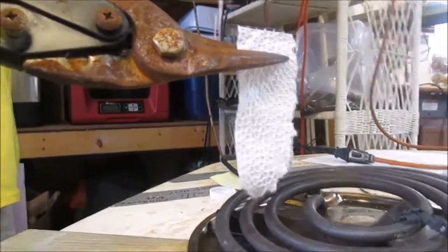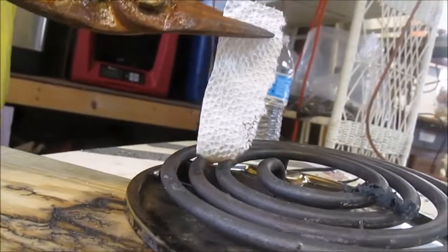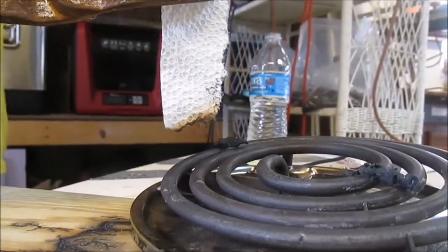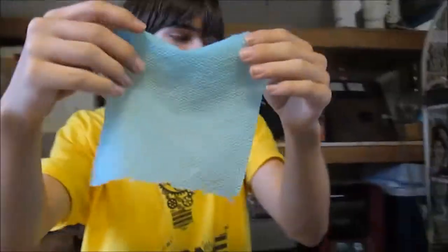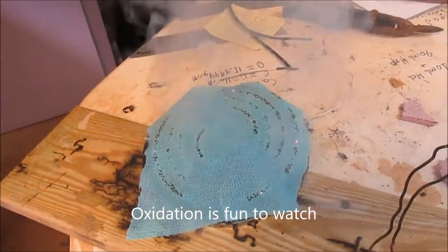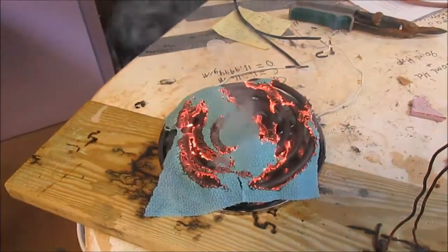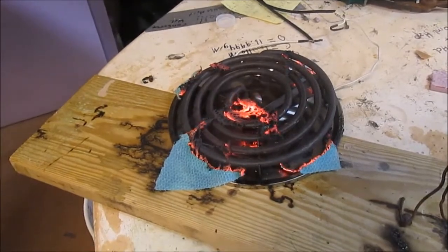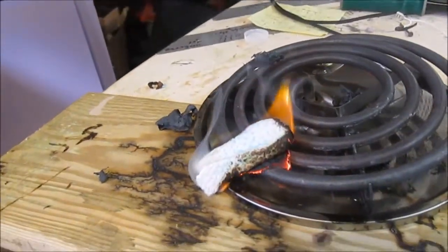When prompted in a similar manner, regular paper towels would not continue to smolder and would only burn fully when a sufficient portion of the paper towel was exposed to direct flame. When confined inside a dry paper towel, the green flame could be sustained for longer.